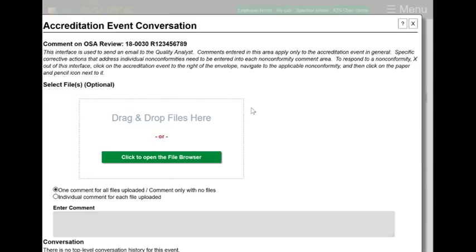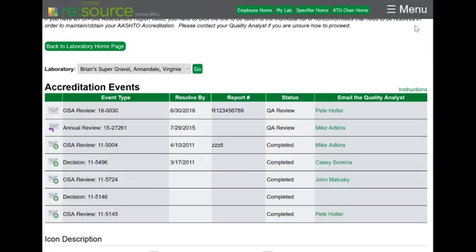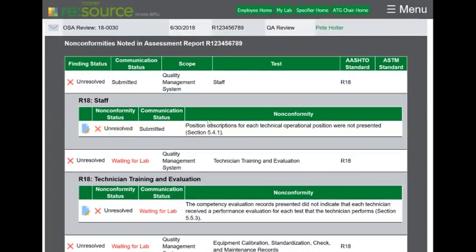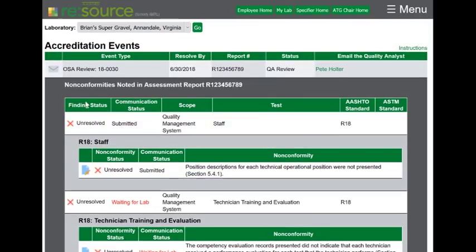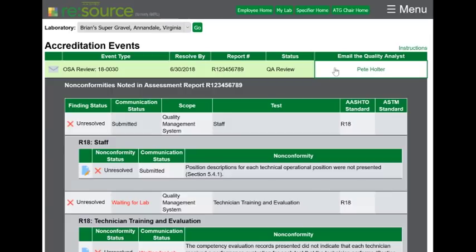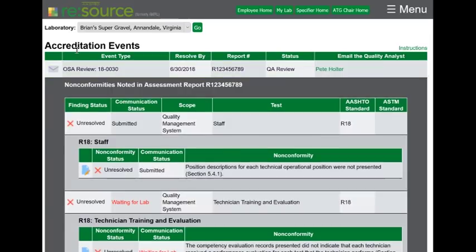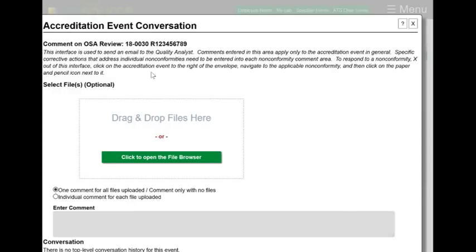This is not where you would submit your corrective actions. I submit my corrective actions on the individual finding by clicking here. If I want to send a general message, I can either send it to the quality analyst directly using my email, or I can click on this envelope which opens up another window that is for just general comments.